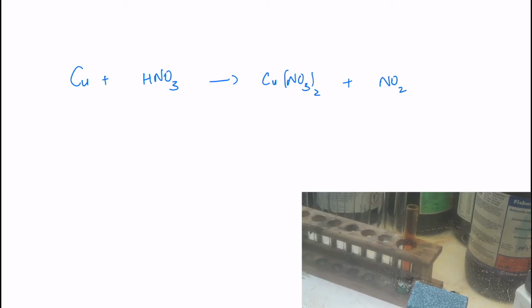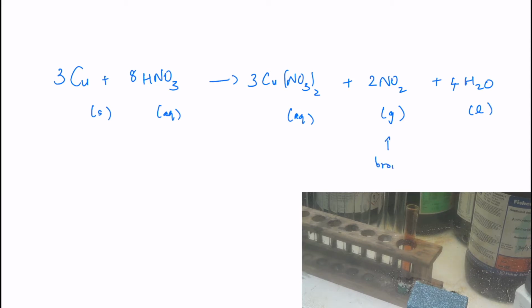Okay, so NO2 causes respiratory distress. I really need to go and turn on the other ventilator. So NO2 is a brown gas, and I really must leave this now because this fume hood has not got a working ventilator, and this gas is really bad for people who have asthma. And well, as you can see, it's a brown gas. It's definitely not hydrogen gas, which is a colorless gas.